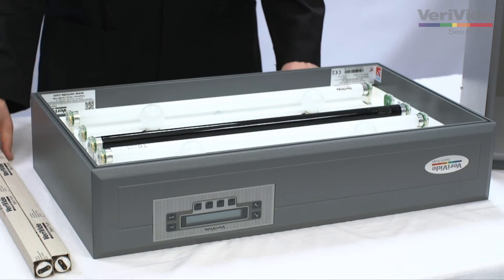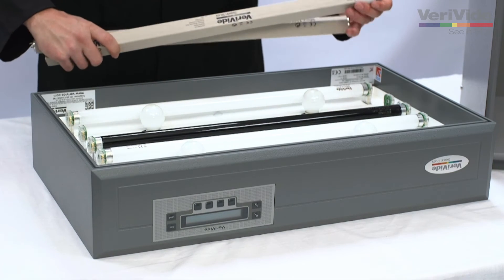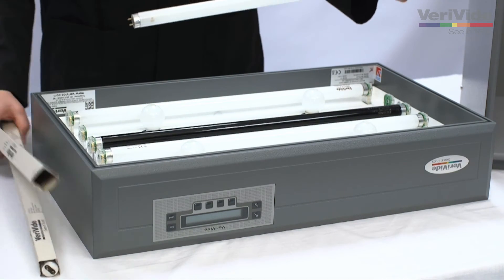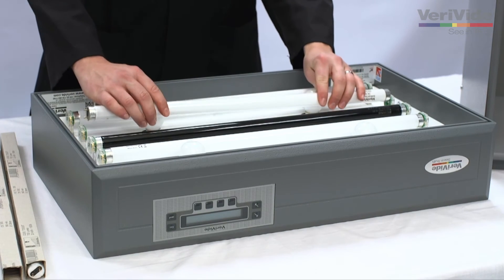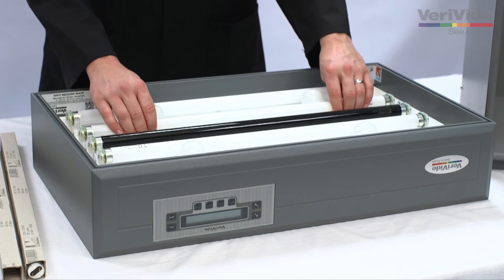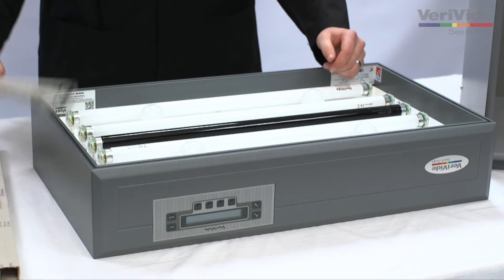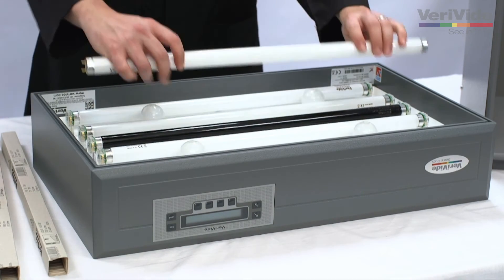Next, remove a new lamp from its protective sleeve and place the lamp into the lamp holder as shown. Twist the lamp 90 degrees to lock into place, taking care not to damage the housing.